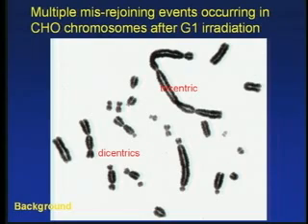And this is the anaphase bridge formation, because the chromosomes are pulled apart to two sides of the cell. But this piece of chromosome has two centromeres, one pulls this part, the other pulls that part, but it cannot go along, so it's stuck in the middle. It's called anaphase bridge formation. And if you look at this again, there are several dicentric structures here. You have a dicentric, there you have a dicentric, and there you can see a tricentric, three centromeres. These are all examples of different types of chromosome exchanges.